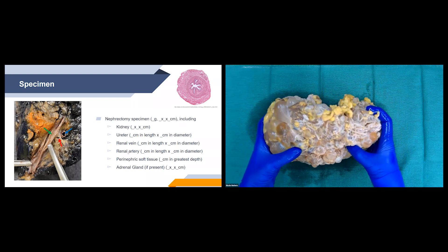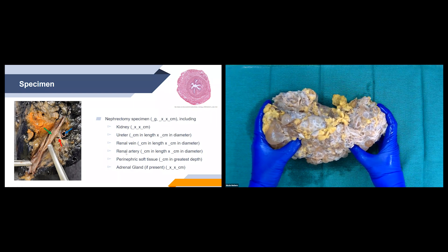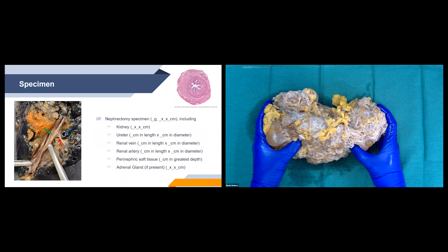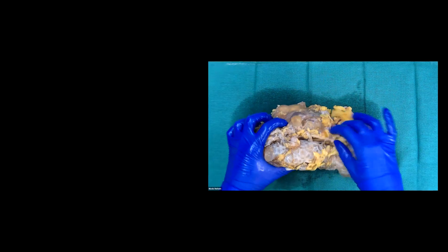Tips for identifying these structures: look at the lumen of each one. The ureter typically has a star-shaped lumen — you can see that on the cross section in the right-hand corner — versus the smooth-lined renal vein and artery. You can also open the ureter longitudinally; the inside will have longitudinal ridges, while the renal vein and renal artery will be smooth-lined. The renal vein is usually larger in diameter with a thinner muscle wall; the renal artery is smaller with a thicker muscle wall — the blue arrow shows the renal vein and the red arrow shows the renal artery.